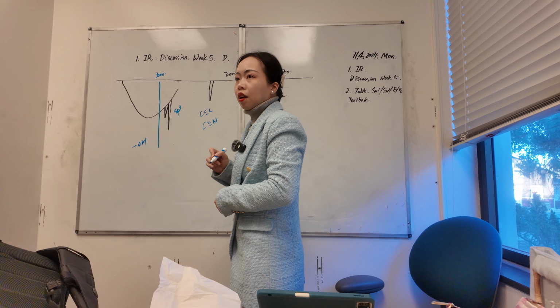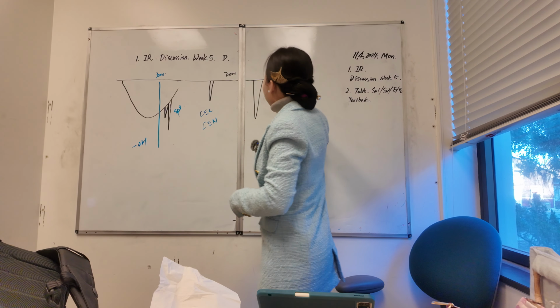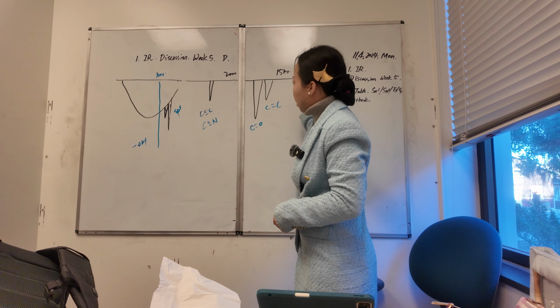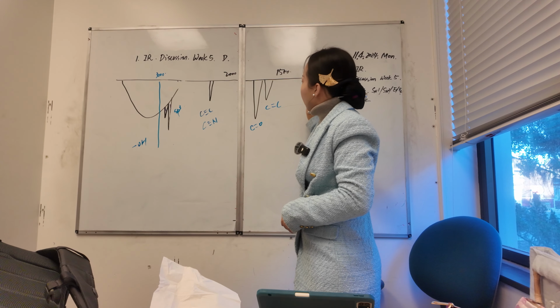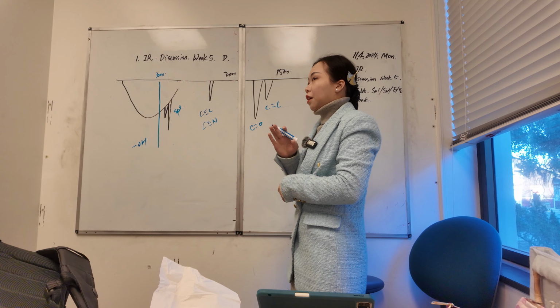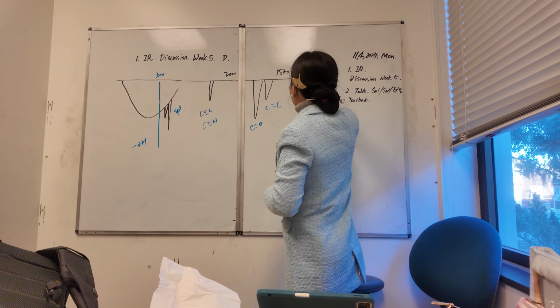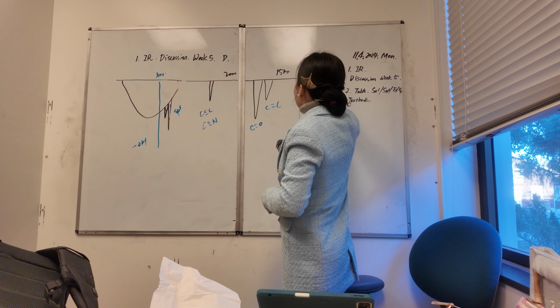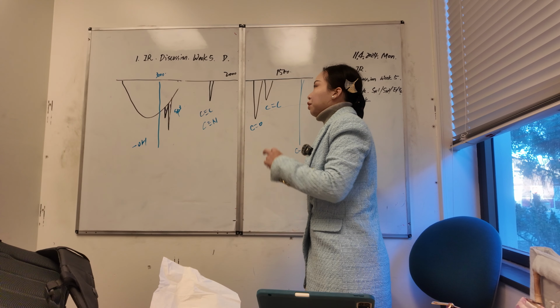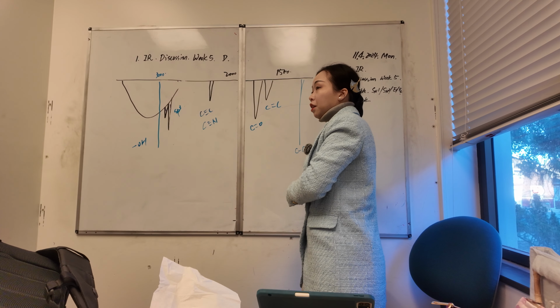Okay, here is CO and CC. I know there are fingerprint peaks. If the answer key writes something like CO, you don't need to identify that one yourself.